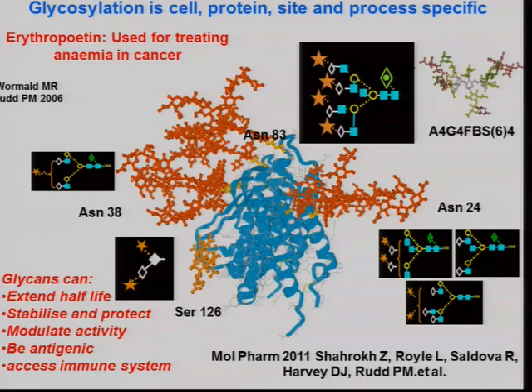Also with the mass spec, if everything flies with more or less efficiency, you've got to have a standard for every sugar in your profile. So think of EPO with at least 70 glycans. You're going to have 70 mass spec standards running. So people try to do isotopic labeling to measure a standard against the particular glycan. You measure the amount of your isotopically labeled standard, and then you can quantify your glycan. But I think absolute quantitation is really, really challenging. People are trying it, but it's going to take a while to get there.